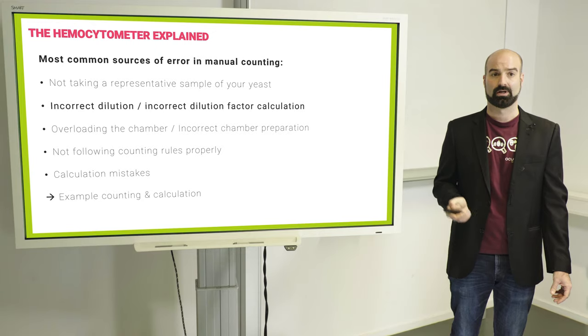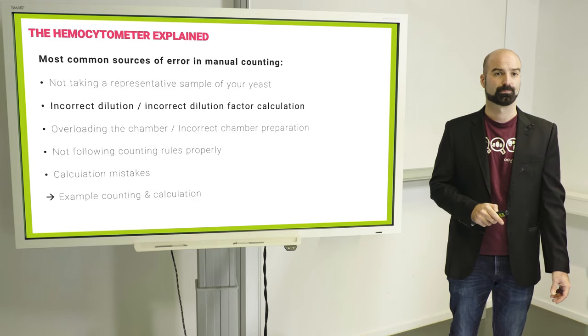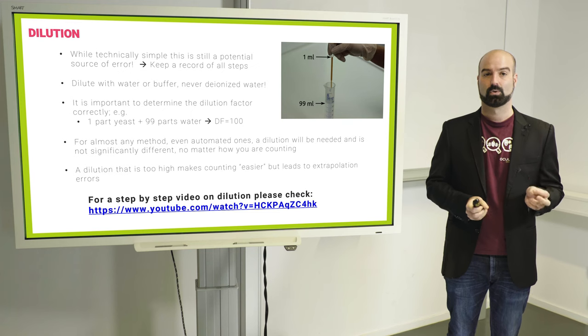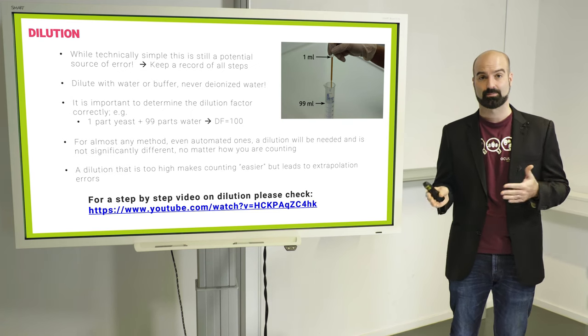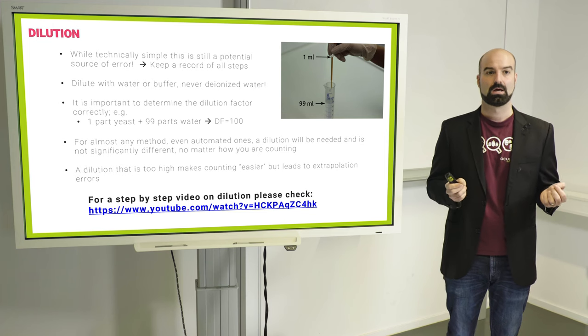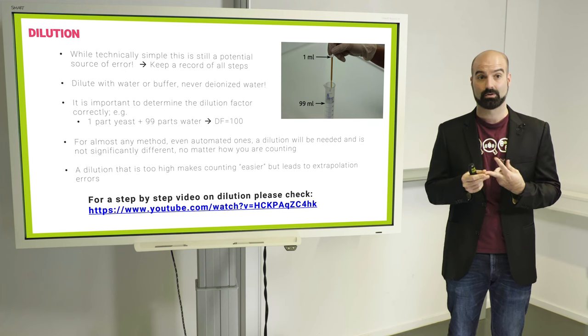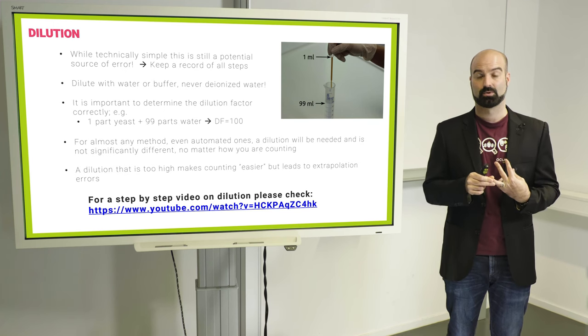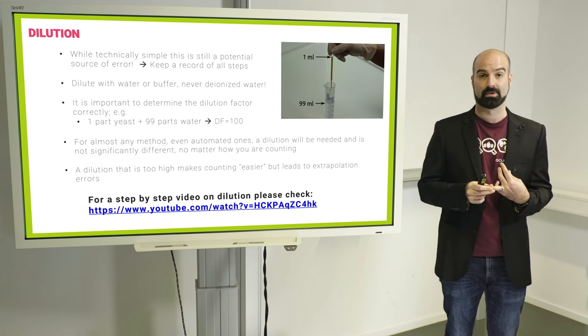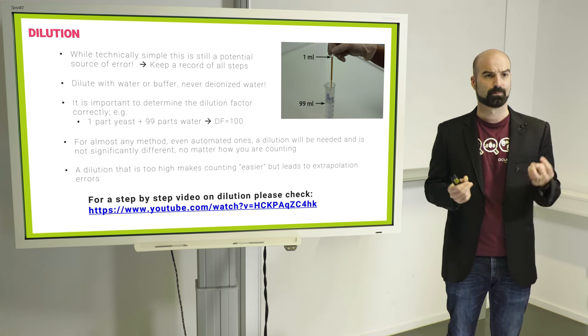The second error is actually one of the most common ones, which is incorrect dilution or calculating the dilution factor incorrectly. Dilution itself is technically very simple. You just take your sample and dilute it in water. But errors can and do happen here. You should watch out and write down all of your steps so you can trace your errors afterwards. Also, you should be diluting with buffer or with water, like regular tap water, not with deionized water. Deionized water puts osmotic stress on the cells and can affect the viability measurement quite a bit. Sadly, we see this quite often. The dilution factor is also fairly simple to calculate. We'll go into the formula later, but errors do happen here as well. So watch out.